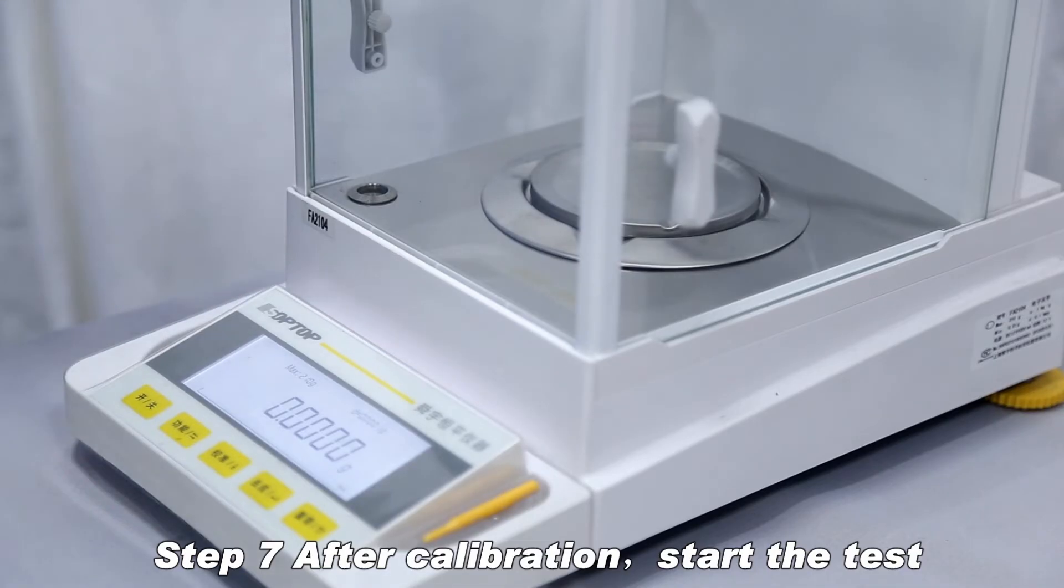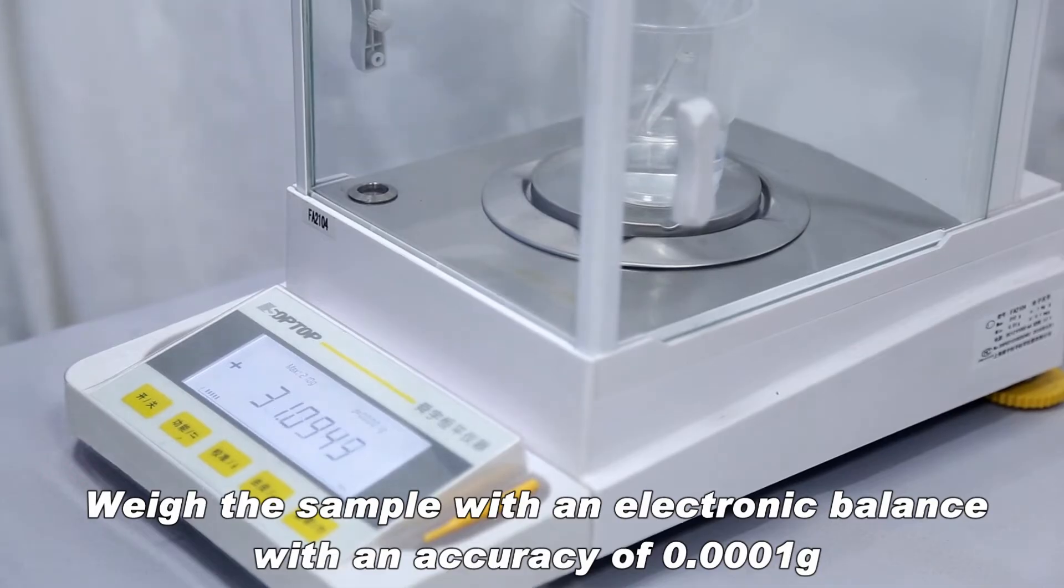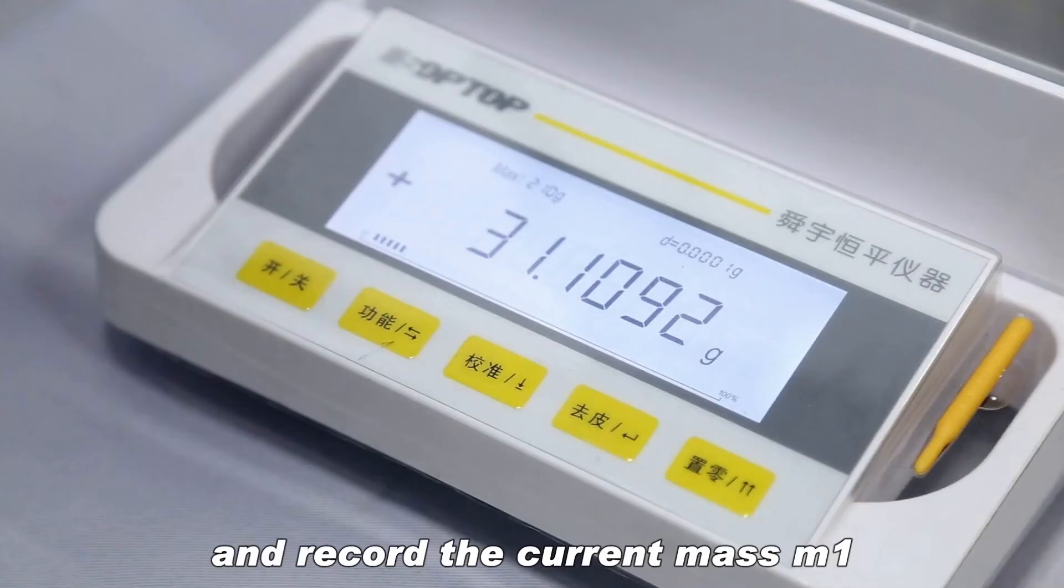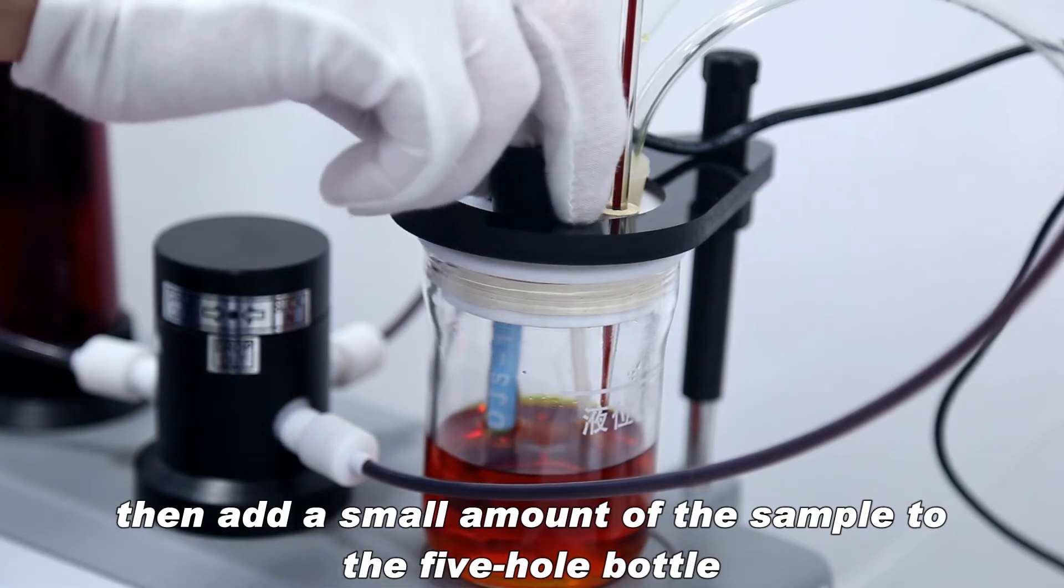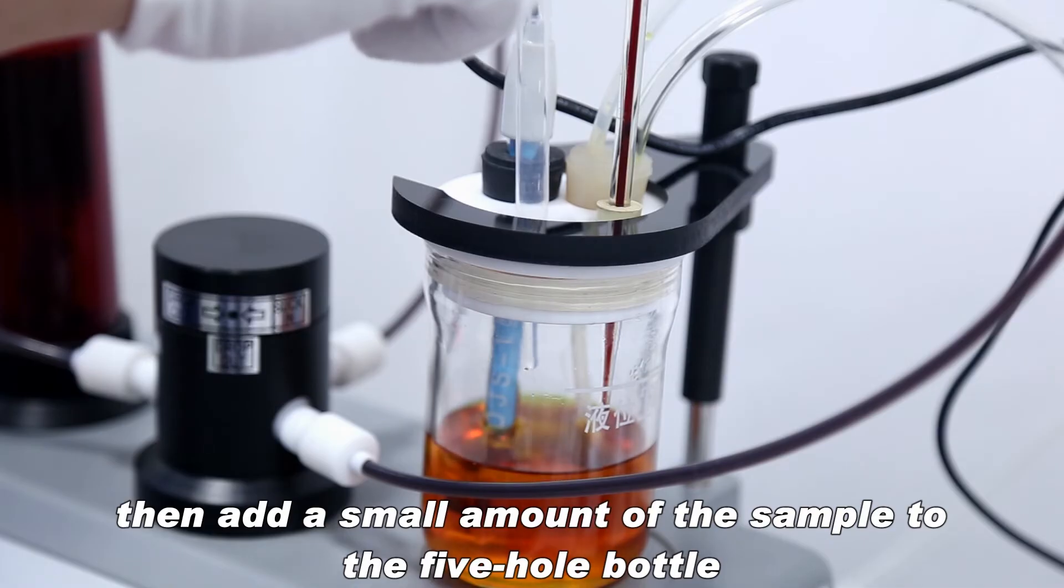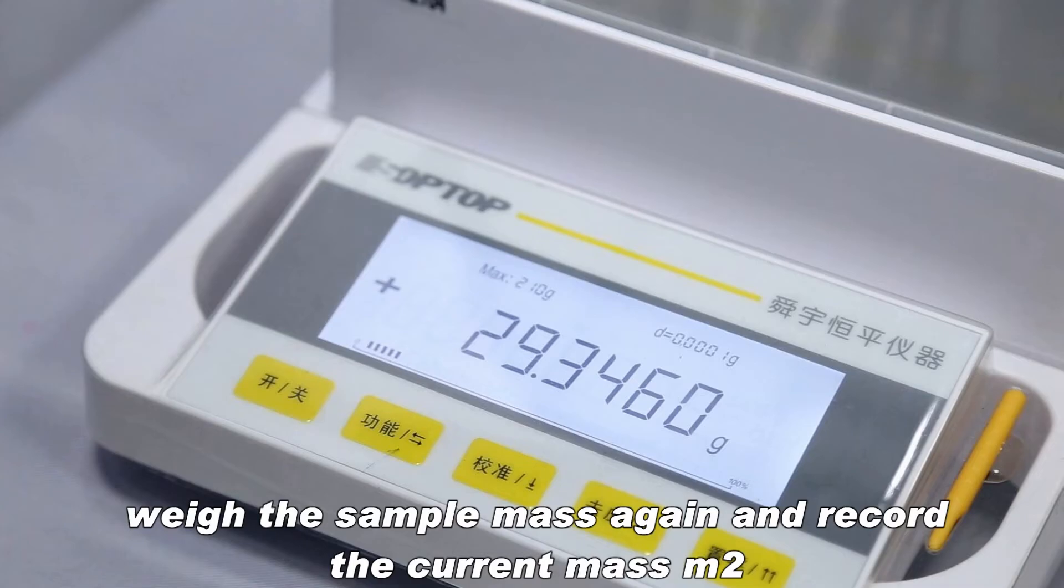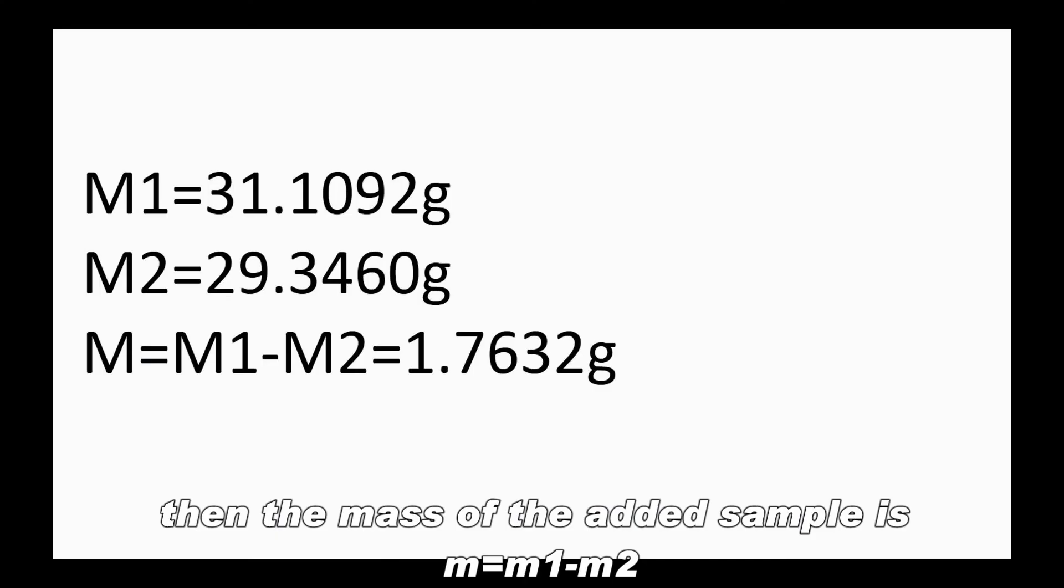After calibration, start the test. Weigh the sample with an electronic balance with an accuracy of 0.0001 grams and record the current mass M1. Then add a small amount of the sample to the 5-hole bottle. Weigh the sample mass again and record the current mass M2. Then the mass of the added sample is M equals M1 minus M2.